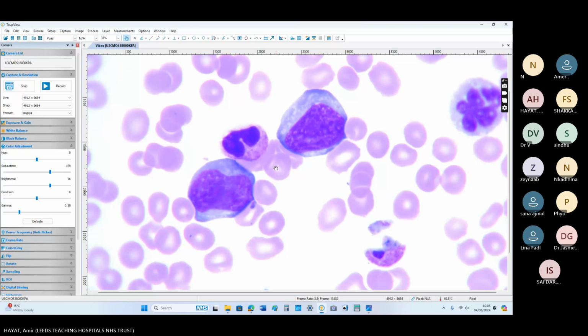Okay. So the flow cytometry result of this patient is CD5 negative, CD10 positive, CD19 positive, and CD20 positive. This is consistent with a B cell. Do you think this is large B cell lymphoma? Yes, it could be the DLBCL because of CD10 positive and B markers are positive, CD5 negative.